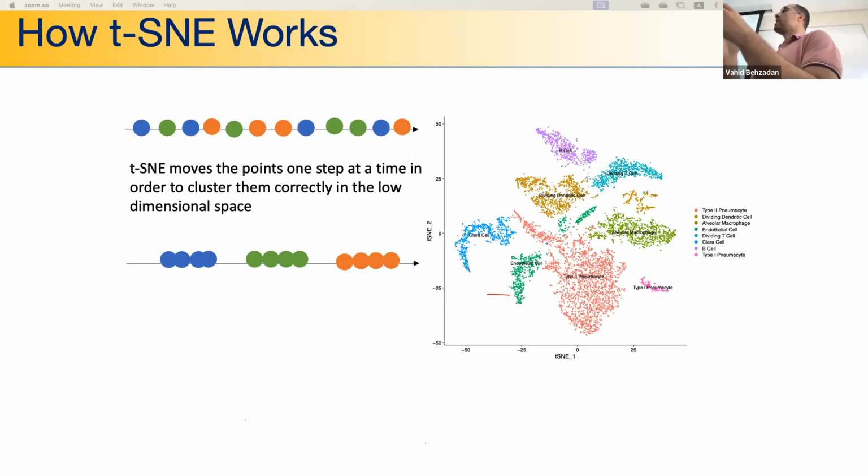What you're saying is that rare cells will be similar to dying cells or the cells that we filtered out, which is not true. It could be, but usually it's not, because this is an assumption that rare cells in our body will behave like cells that should be filtered out. What I'm saying is that if we find a rare cell type, it should act like normal cells, but it should be in a different location, in a different cluster.